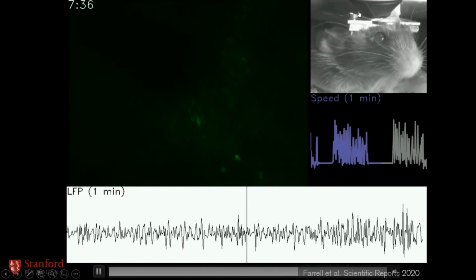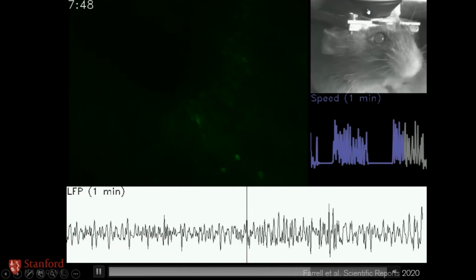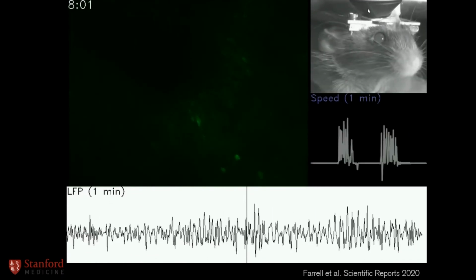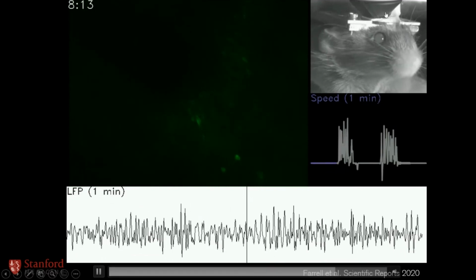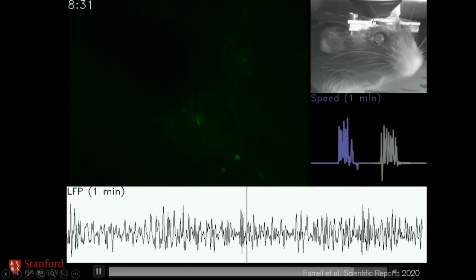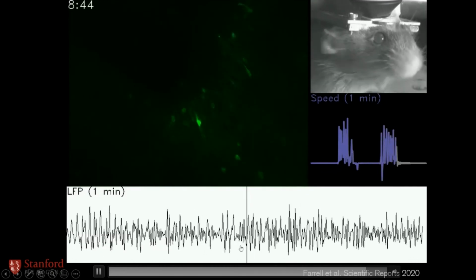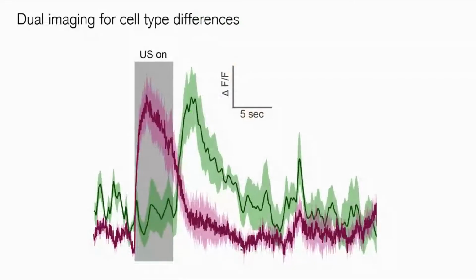You can easily imagine passing a ring around this confocal lens. A ring, depending on the internal diameter, will create a natural focus in space. So something I'm doing and other people are working on is putting rings around these confocal or imaging modalities and then focusing deep in the brain while performing all of these cool recordings at once. It's really an attractive idea.